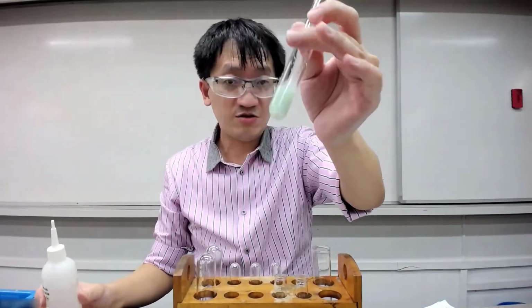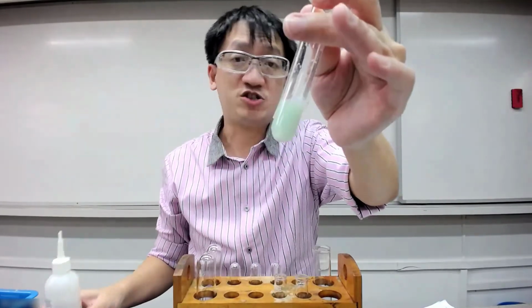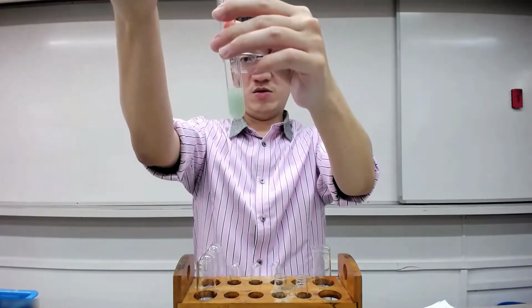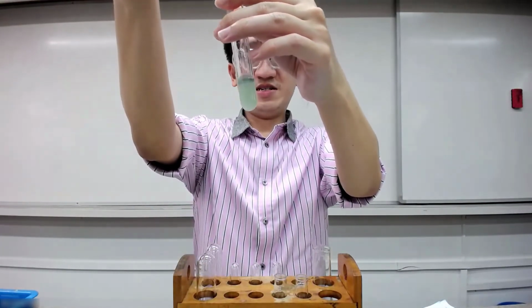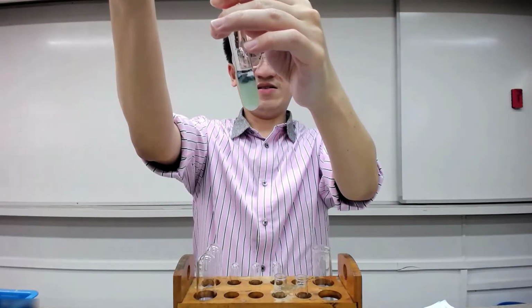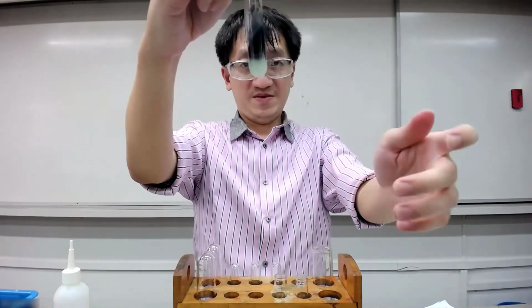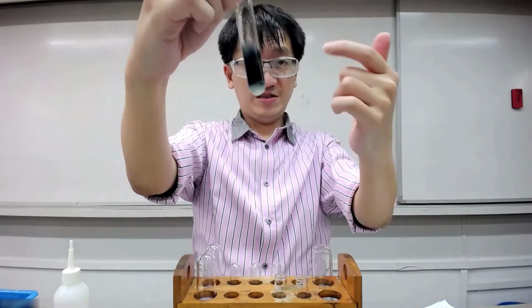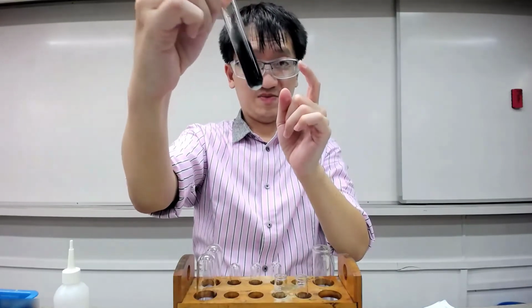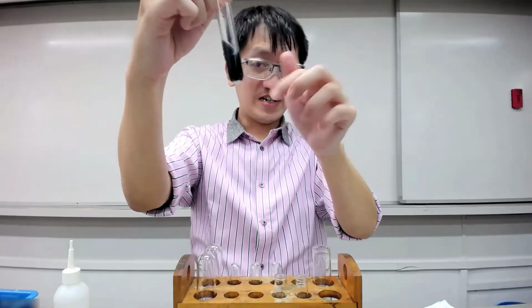Can you still observe very carefully the white PPT dissolve? Okay, let's try. So this aqueous ammonia. Can you see? Can you observe that you actually get a lot of precipitate coming up? Are you able to visualize whether the white PPT dissolves? You can't, right? And then you'll be wondering what all these are.